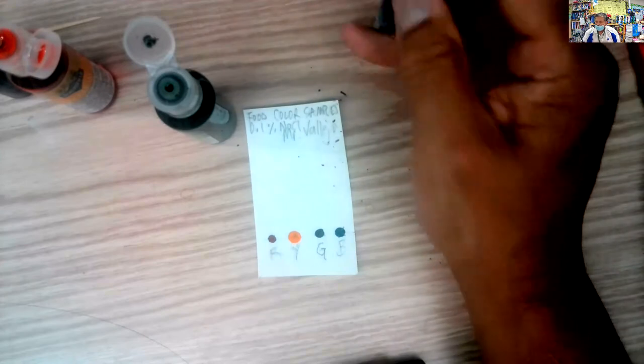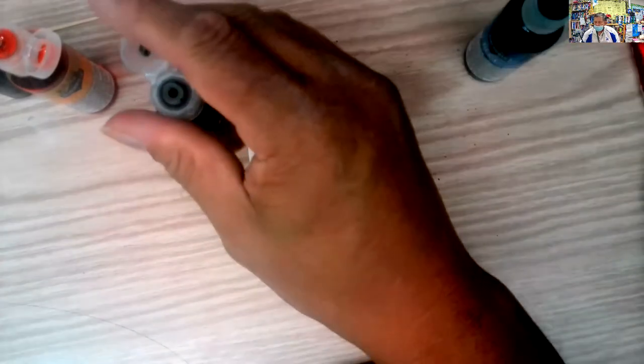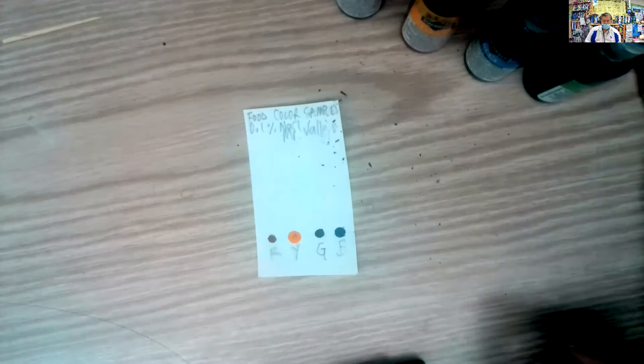I'm going to put the labels on these because these things get all over the place and one drop will ruin your day. So I've got the yellow closed up and also I have the red closed up. Okay, so now we got our chromatography paper. Let's go back to instructions.